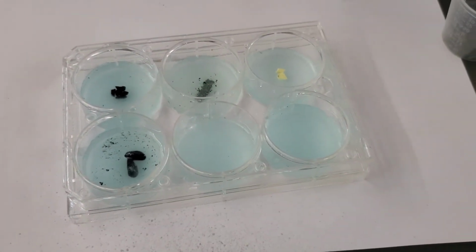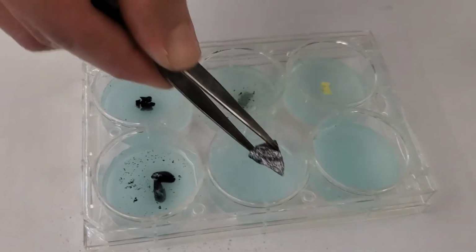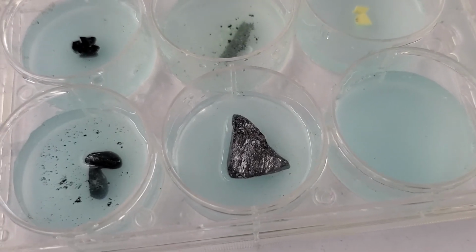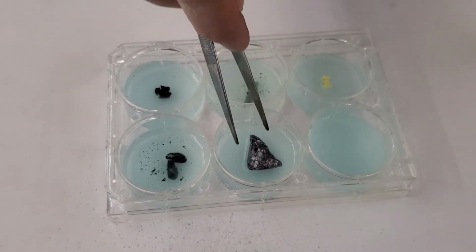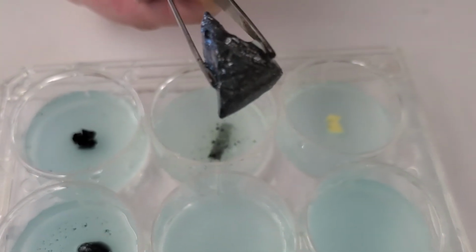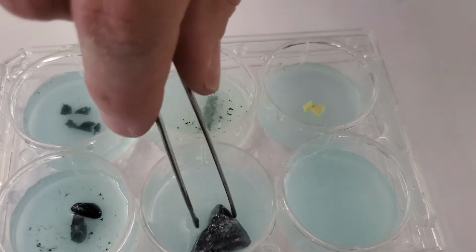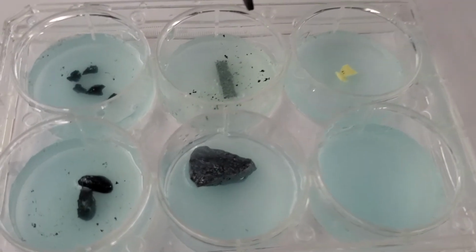Next one is going to be silicon. And I'll pick it up in a second. I'm just going to let it sit in the liquid for a little bit, then I'll pick it up and see if it changes at all. Color doesn't really look any different. If you look at the bottom, I'll shake it around a little bit. You don't see the dark splotches like you saw with the other ones.